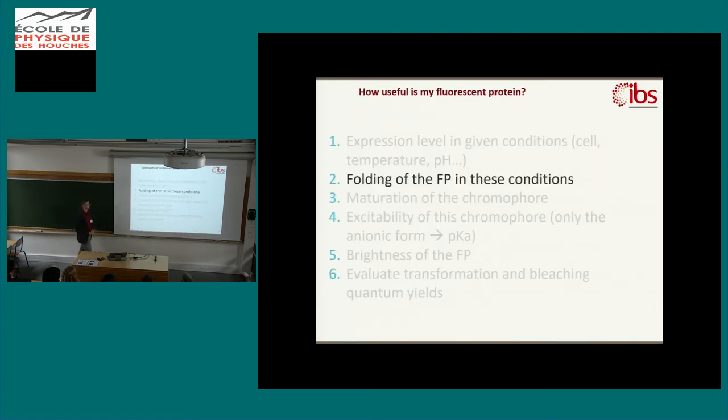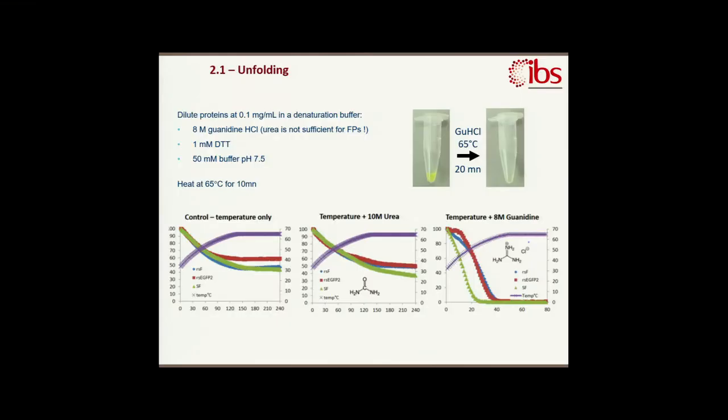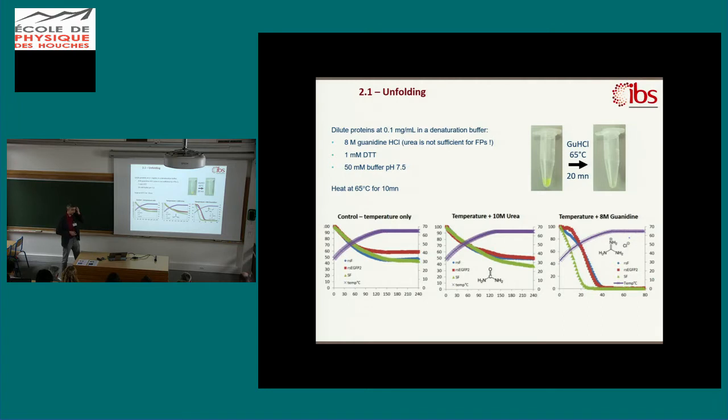Folding, that's one of the most tricky ones, because it's very difficult to unfold fluorescent proteins. If you make an SDS page, after boiling your samples in SDS and beta-mercaptoethanol and whatever, you make your gel and put it on a fluorescent plate on a transilluminator, it will still glow a lot, so it's very difficult. And in fact, the common urea test, with temperature and urea, doesn't work well. That's, for example, a control.